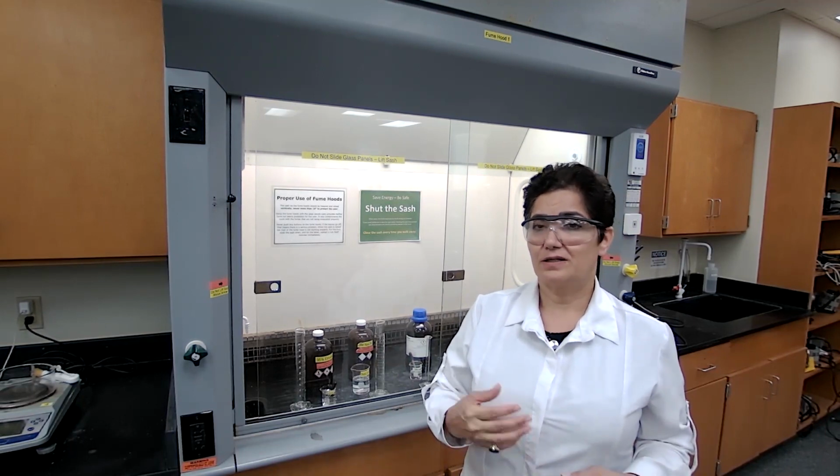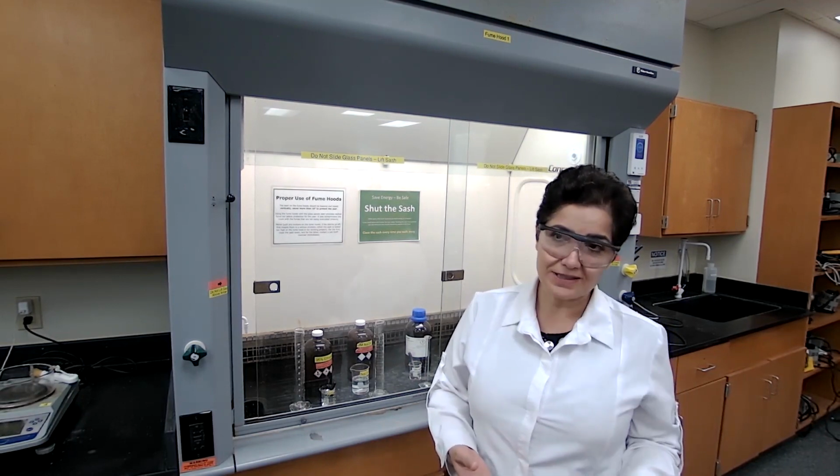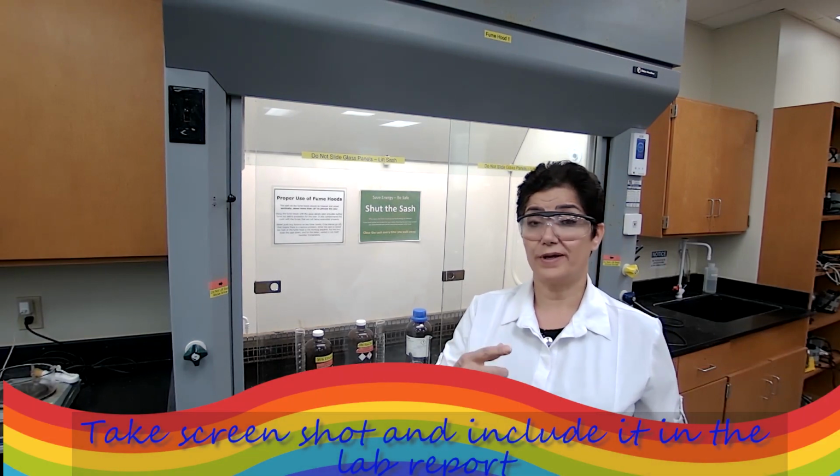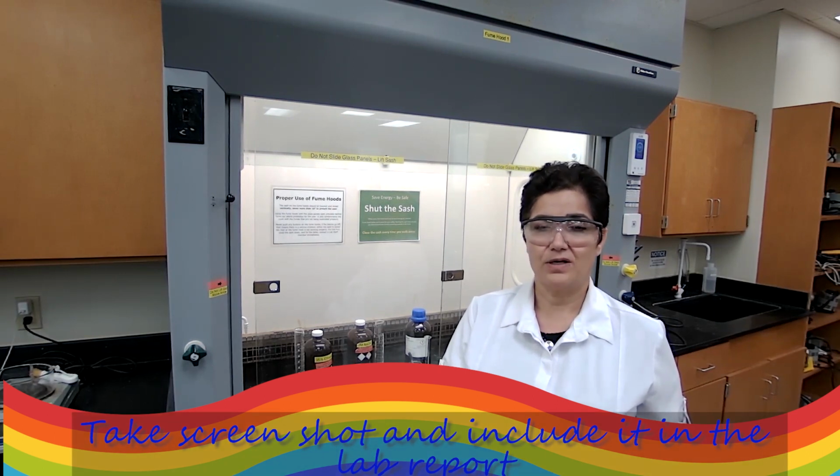This reaction takes place in alcoholic solution, so the solvent that is used here is alcohol. Sodium hydroxide is needed to remove alpha hydrogen from the acetone in this case, because benzaldehyde doesn't have alpha hydrogen. The ratio of moles of our ketone to the aldehyde, benzaldehyde specifically, is 2.2 moles of benzaldehyde to 1 mole of acetone.